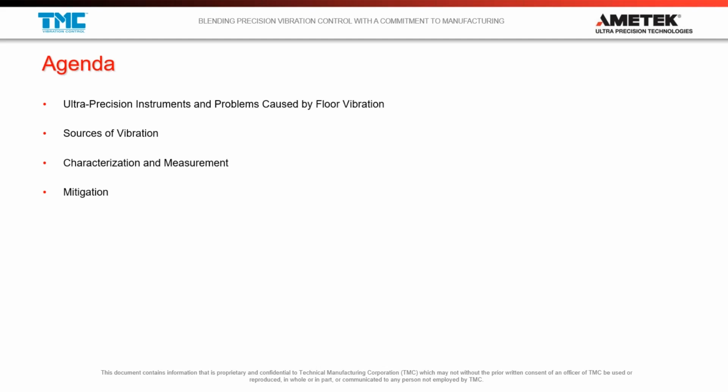Once we figure out the types of instruments that we're talking about here and who's going to be interested in floor vibration, we're then going to start digging into, well, what are we dealing with? What are the sources of vibration, and where does floor vibration come from? And we'll talk a little bit about, well, how do I know if it's floor vibration or if it's something else? There are other sources of vibration out there that we should be aware of. But we're going to focus the rest of our presentation on floor vibration, which will bring us to our next topic, which will be characterization and measurement.